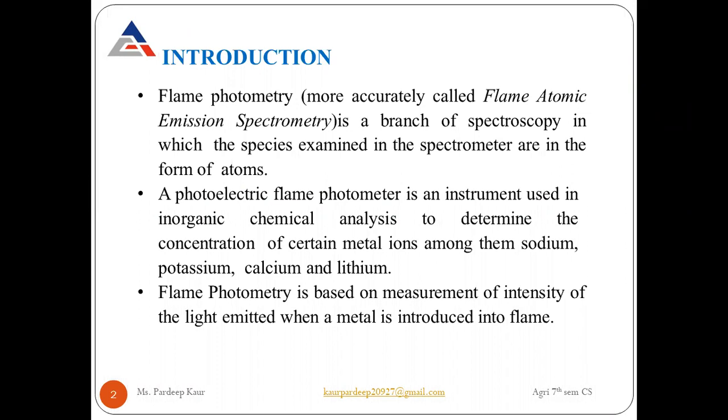Flame photometry is a branch of spectroscopy in which the species examined in a spectrometer are in the form of atoms. It is more accurately called flame atomic emission spectrometry.